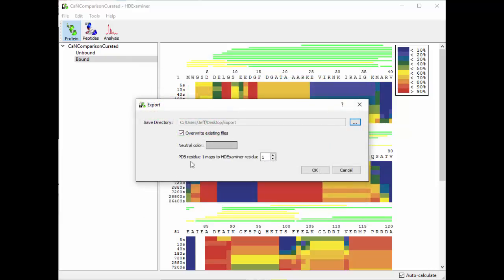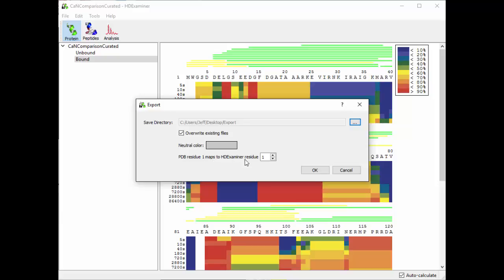And then finally you can say which residue maps to which. So what does this mean? Well, sometimes in HD Examiner you'll be studying a particular piece of a larger protein, and in that case if you color residue one relative to HD Examiner to residue one in PyMOL, they might actually be different residues. So what this means is PDB residue one maps to HD Examiner residue—in this case one is the default.